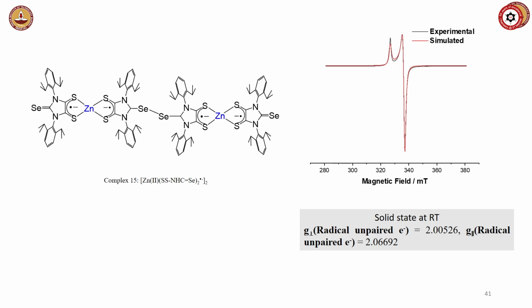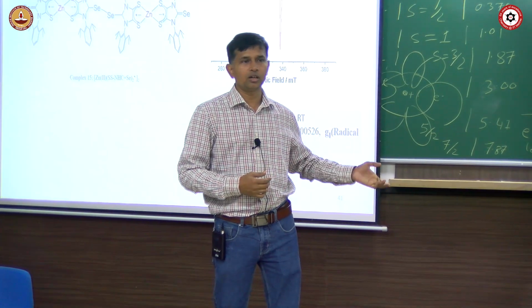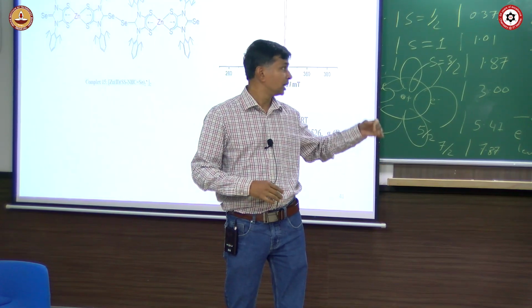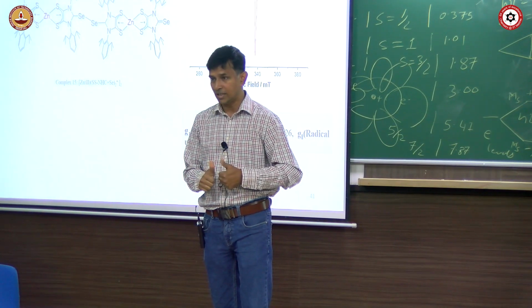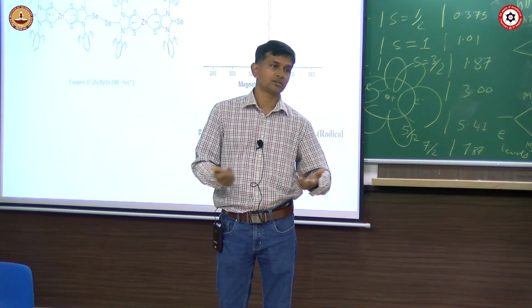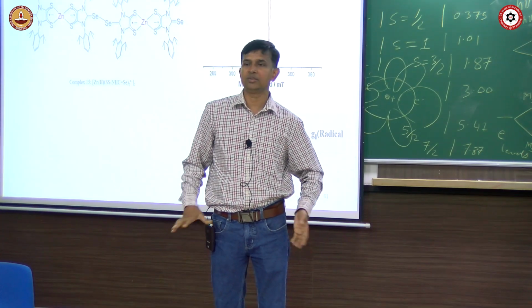So now my question is whether these 8 classes are similar classes or very different classes? Yeah, very different. If you look at those 8 classes in my 1-2 hour lectures, they are very different. I take the very fundamentals and apply them to our own molecules, and show how EPR spectroscopy can actually be brought in. And if you have nickel 1 plus, it is like a d9 system, it will give a similar EPR to copper 2 plus, because they are d9 systems and their distortion will be similar, and they give similar EPR.